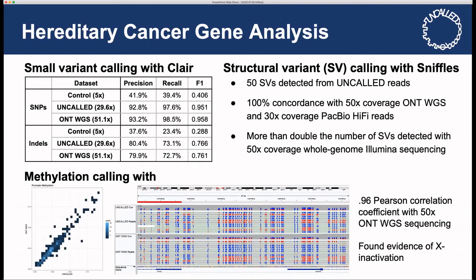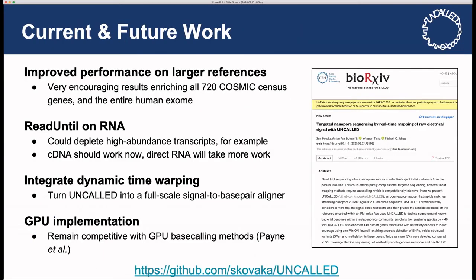So this is a great opportunity where we can take a certain amount of capacity on a MinION device and skew it to whatever regions of interest, and get really robust, really accurate results on the back end from that. We have a preprint that describes these results. Since then, we've been working hard to scale it up. In the preprint that's out there, we said about 100 megabases was the effective practical size, although we've smashed through this limit thanks to Sam and Bohan's great work.